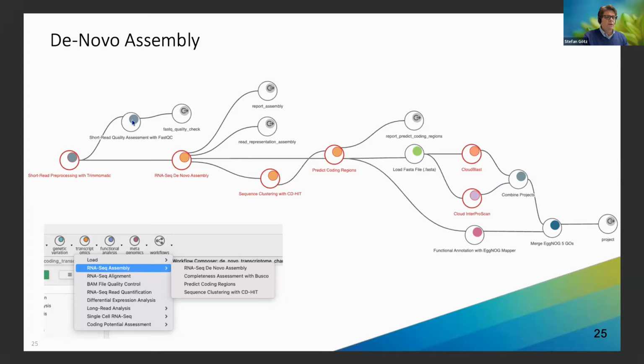It's always good that, most of the time, you get your samples from your sequencing facility already quality checked. It's always still a good idea to recheck, right? Even if you get those fancy reports with all the plots and everything looks great, do your own check, because what you get is not always what you see. So your own FastQC check is important. And then you have tools like Trimmomatic or Cutadapt in OmicsBox, super easy and really fast because it's all parallelized.